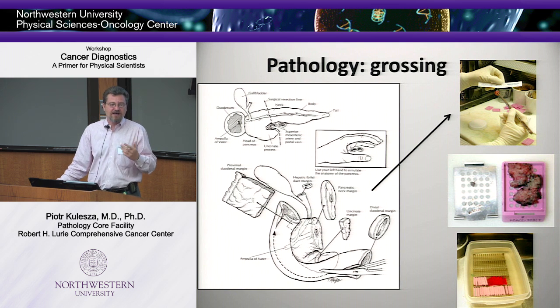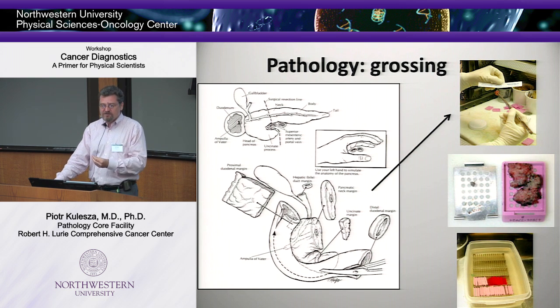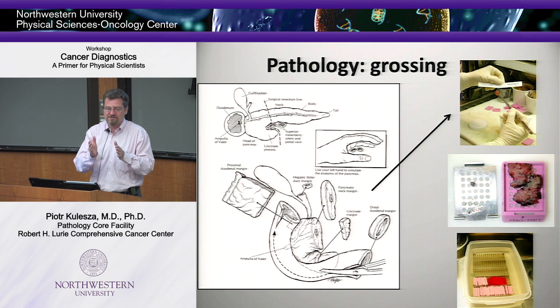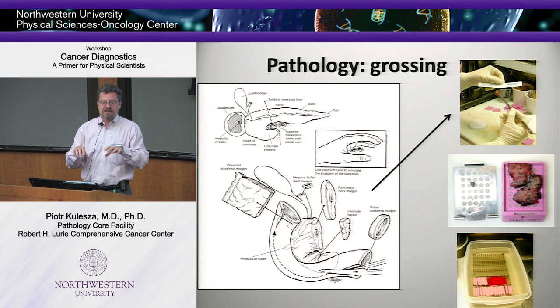You can fix things in ethanol, which I also like, not only like that guy with the beer, but also because it's a precipitating fixative, unlike formalin, which is a cross-linking fixative, which does not cleave DNA, and then Dr. Licht is very happy because he can recover long stretches of DNA as opposed to short 300 base pair fragments. But also it affects how tissue then looks under the microscope. So you now see a row of cassettes in formalin they need to fix, and this is extremely important.